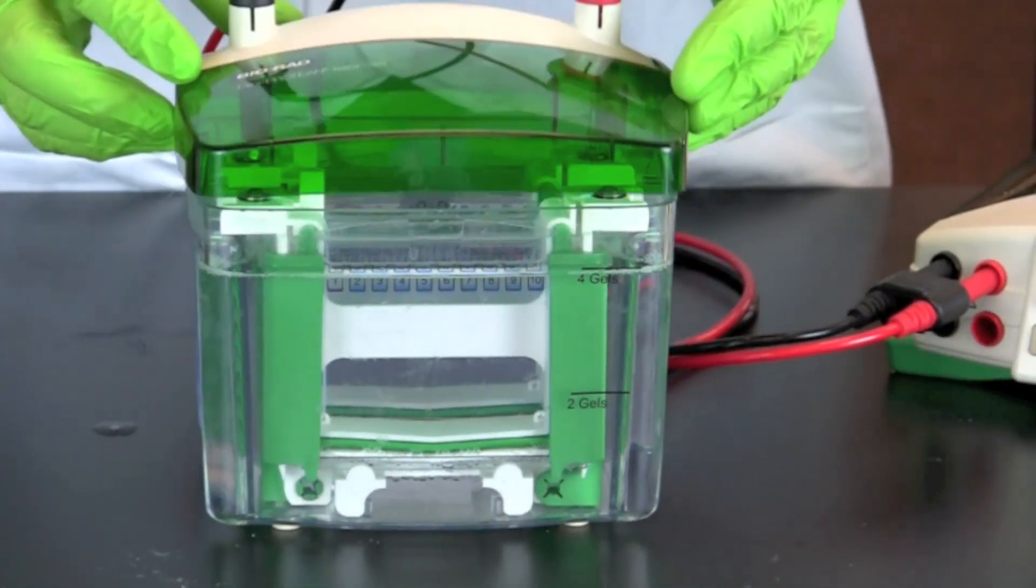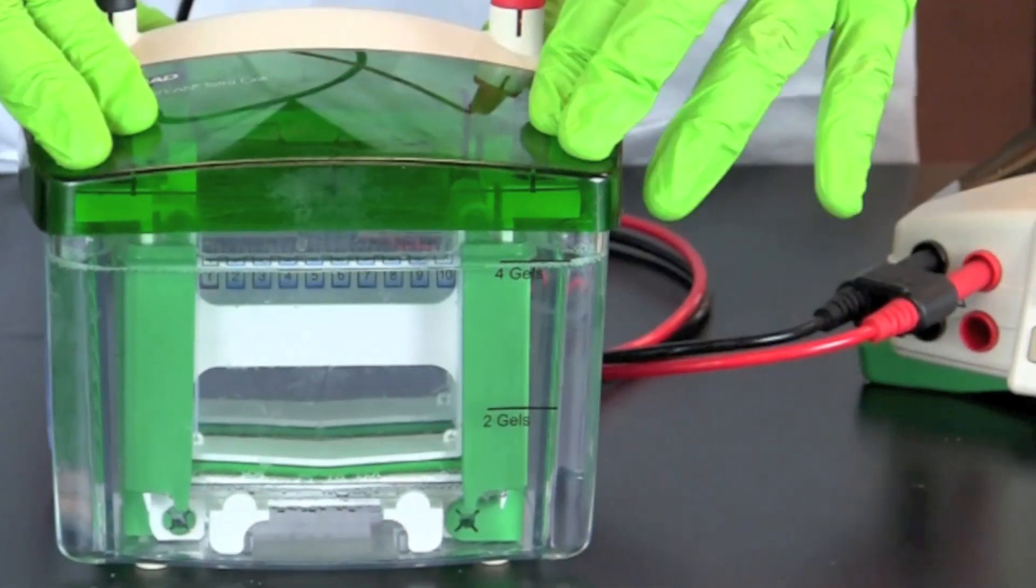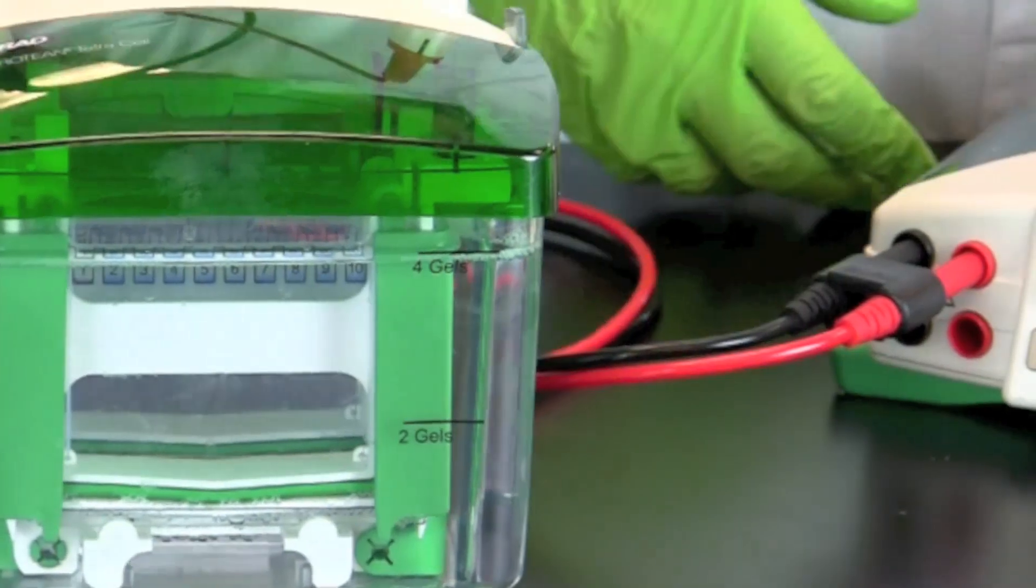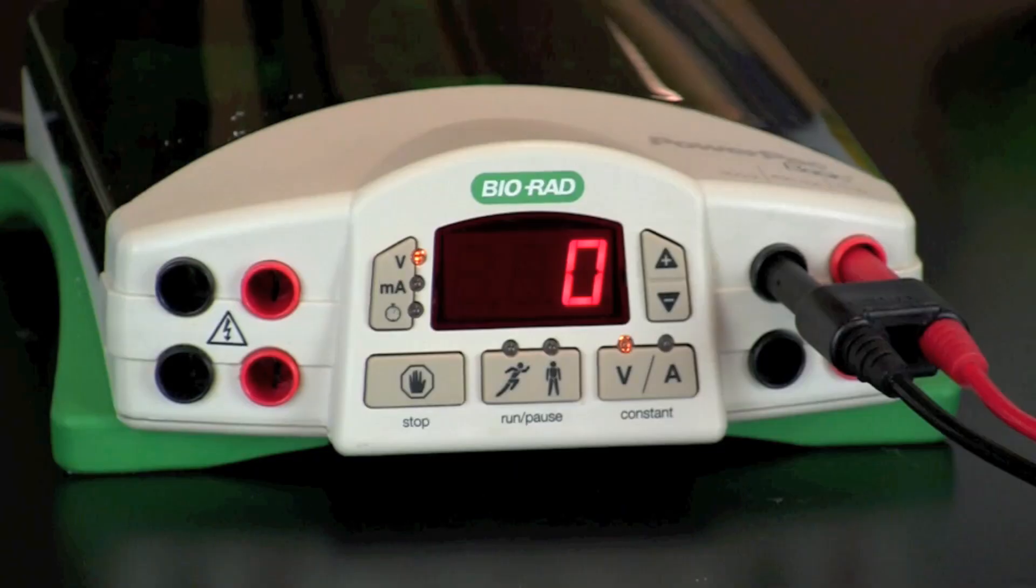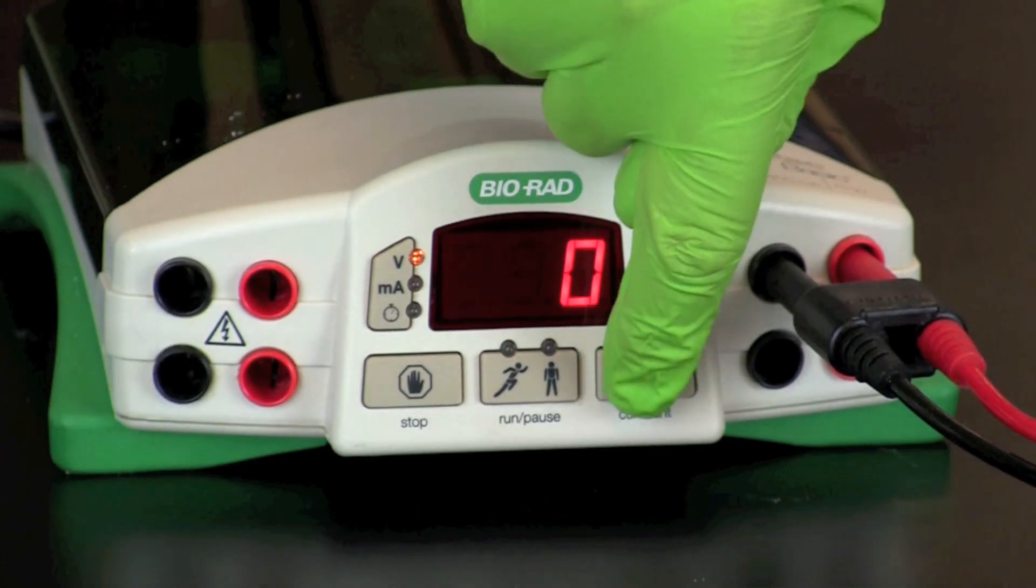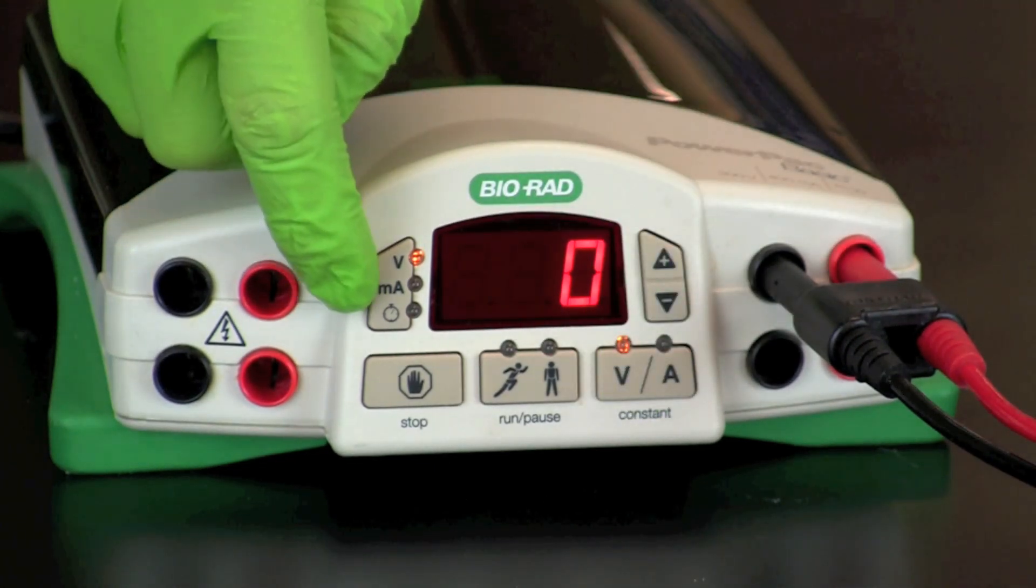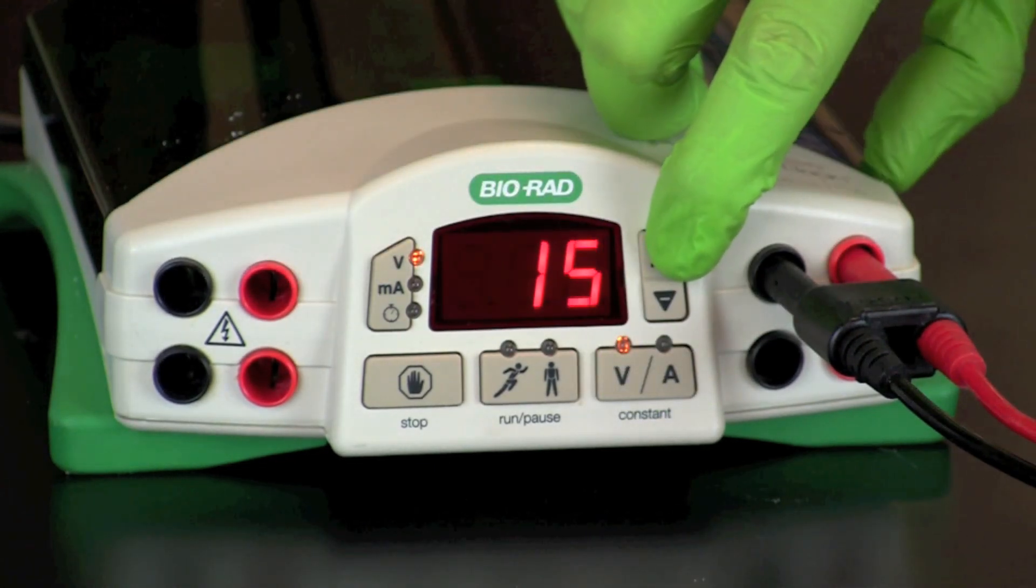Place the lid on the electrophoresis chamber. Connect the electrical leads into the power supply in the proper orientation, red to red and black to black. Turn on the power and set the voltage at 200 volts.